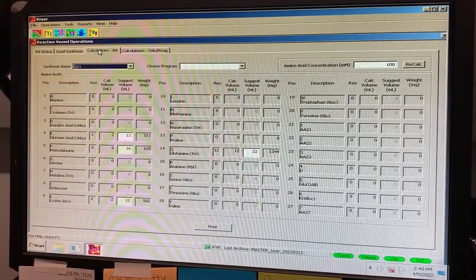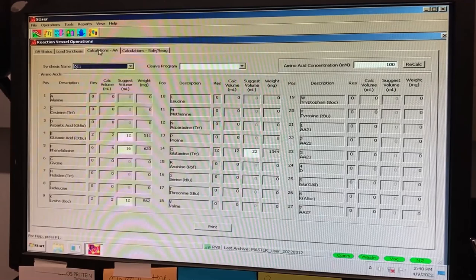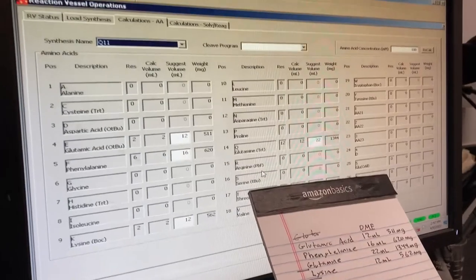On the calculation amino acid tab, the amino acids used in your sequence will have a suggested volume and weight where the volume is the amount of DMF and the weight is the amount of FMOC-protected amino acid to be added to the amino acid bottle. Take note of these amounts for each amino acid.